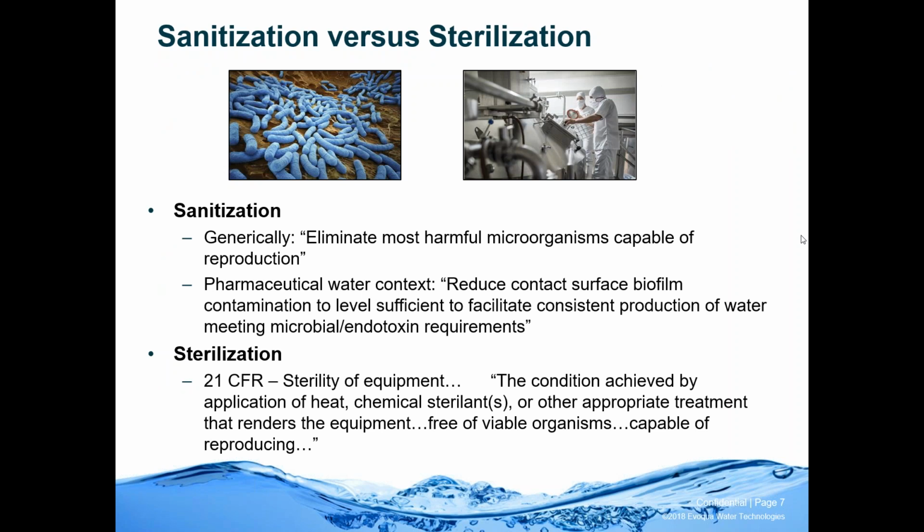So first, we're talking about sanitization. If you look up sanitization and sterilization, both from a generic standpoint and an FDA standpoint, although I will show you where FDA mentions a requirement for sanitization, I can't really find that term defined in 21 CFR, where we'll see that sterilization is. So sanitization generically, and this is combining a lot of definitions, is to eliminate most harmful microorganisms capable of reproduction. And that reproduction means possibly infection. So that's removing it from surfaces. So it's not a complete elimination.